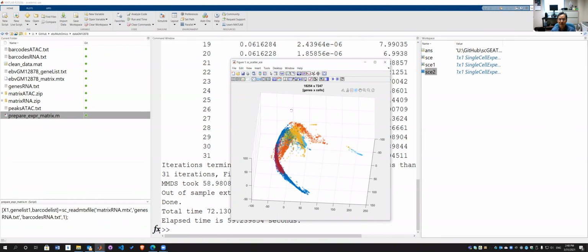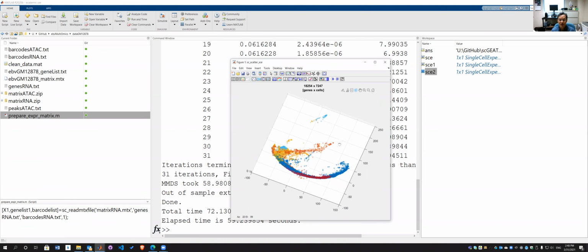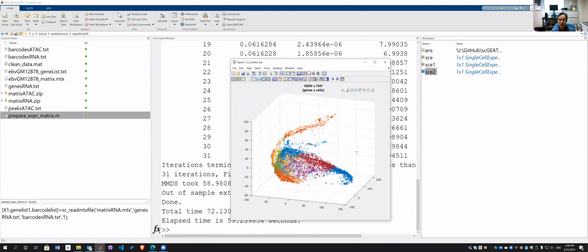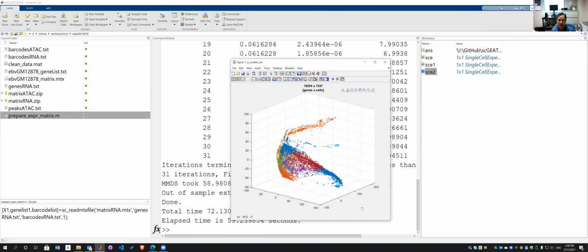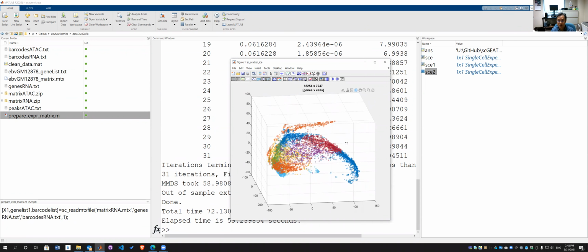All right, so if this is the real relationship between cells, then for this particular shape, I will be able to do something different. Okay, t-SNE gives you the clusters, big one, small one, but here we get some trajectory-like shape. So I'm going to run a trajectory analysis with this data set.